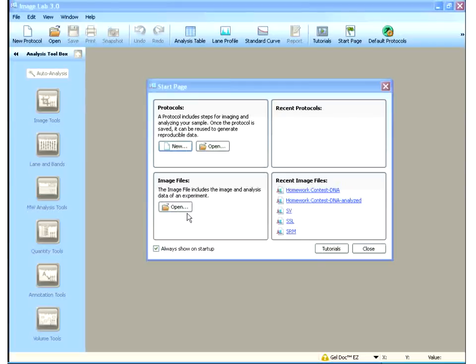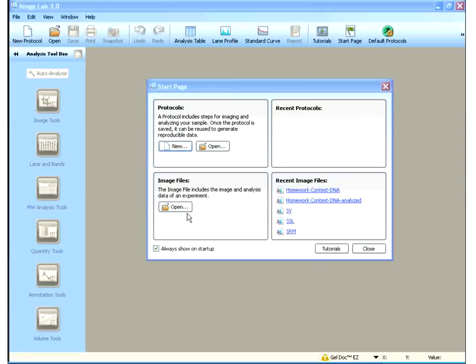And it runs fully on native Mac computers, so Macintosh computers, as well as PCs. That's a really great plus for this software. And for band analysis, it has very powerful new advanced features that I'm going to show you quickly, so that you can learn very quickly how to use this software to analyze your data.